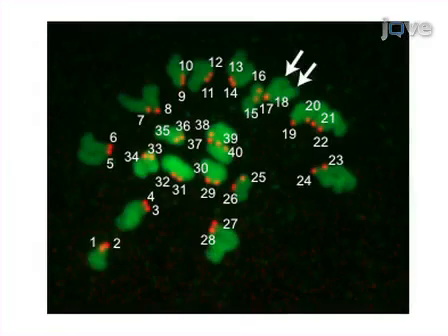Euploid mouse eggs contain 20 kinetochore pairs, giving 40 total spots. In this Z projection of a euploid metaphase 2 egg, DNA is colored in green and kinetochores are colored in red. The arrows point to 2 distinct chromatid arms, indicating overlap at kinetochores number 17 and number 18.